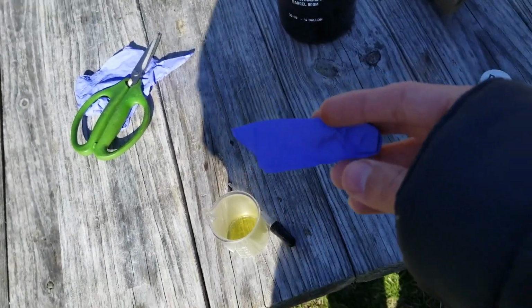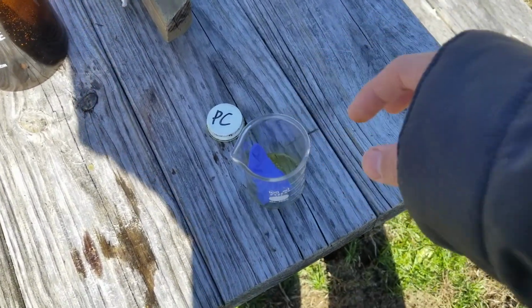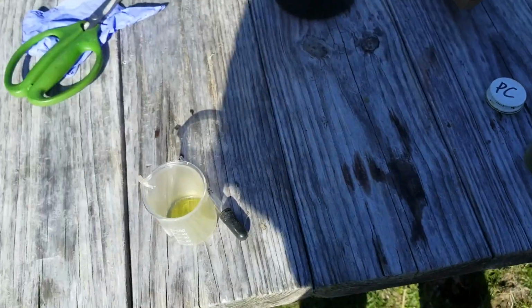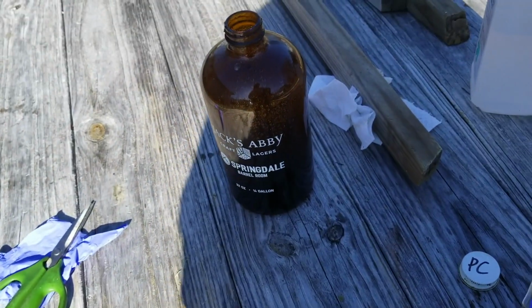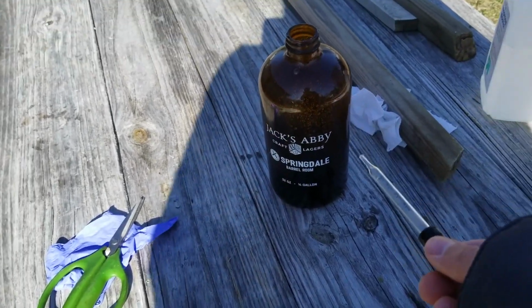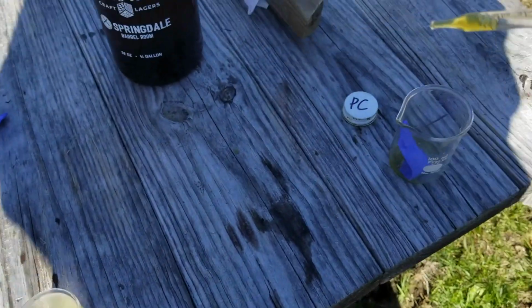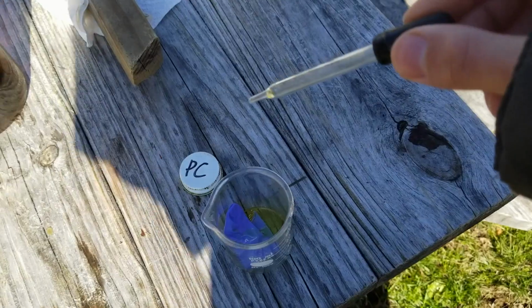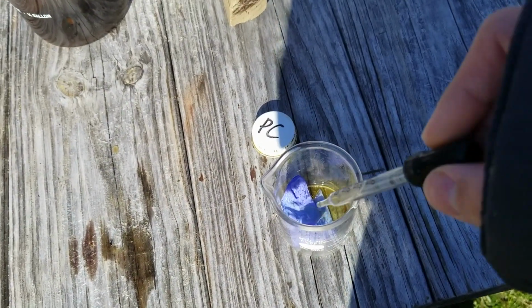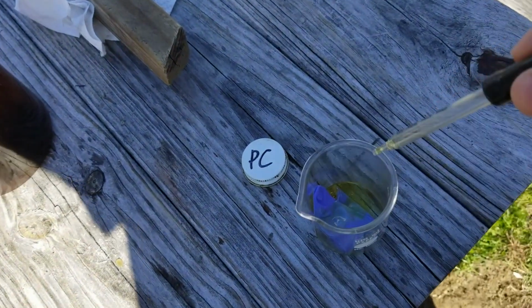Okay, so I just cut out a piece of this glove that was over there, because I want to see, is this actually still fuming nitric? So there probably won't be enough nitric acid to set it on fire there. But the reason I'm asking is because the nitric acid can obviously absorb moisture from the air, and that is a huge container, so it probably could have just diluted it if it was a moist day. So let's see if it'll set it on fire. No, it actually won't. Which means that this is no longer fuming nitric. It's probably somewhere around 80%. I still don't like it though.